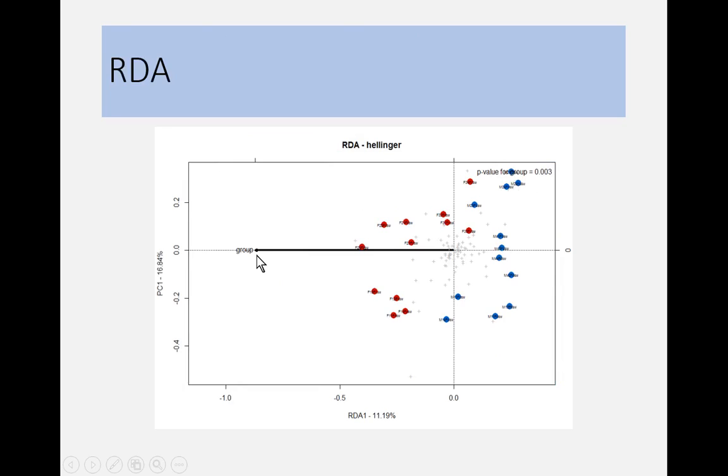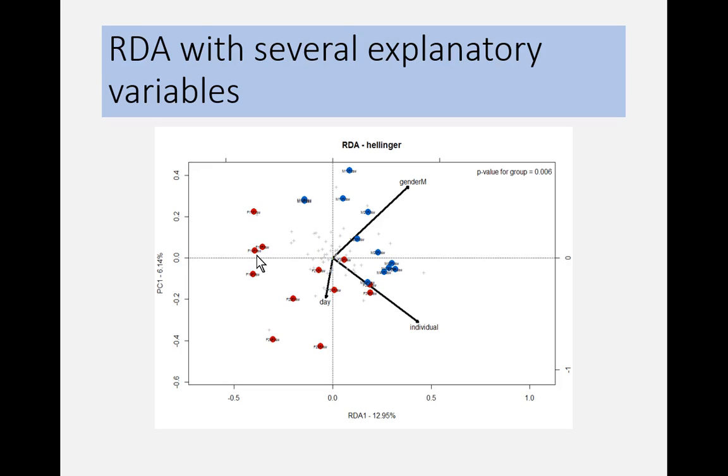And how many, if you are using R, how many types of variables do you use to put together? Basically you can put as many explanatory variables as you like, but it's typically said that you shouldn't use overly many, because then it becomes more and more like the PCA, because it's not then that constrained anymore. So a few, several, but not tons.